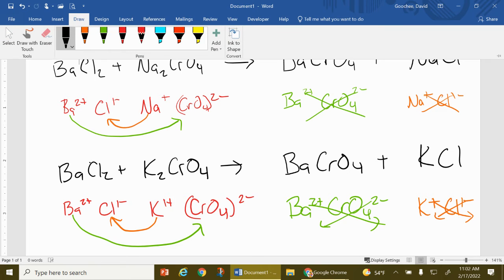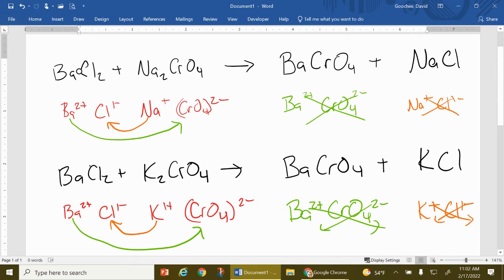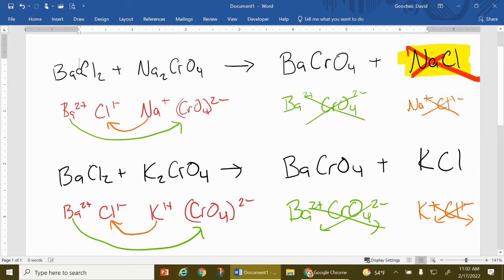Again, the question is, what product did we produce that was that yellow gunky precipitate? Was it NaCl? It was not NaCl. The way we know is that we didn't produce NaCl in the other reaction. So there's no way NaCl can be the yellowy murky gunk because it wasn't present in both reactions. Neither can it be the KCl. KCl didn't appear as a product in both reactions, so there's no way it can be the yellow gunk because it didn't appear in the first reaction.